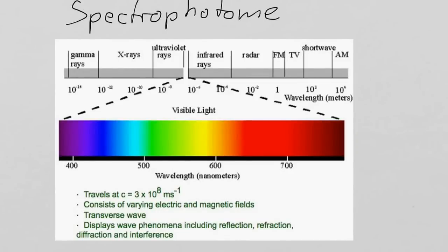So spectrophotometry is an extremely useful tool to measure concentrations, as you've probably experienced in the practical. And it is really based on how electromagnetic waves interact with matter. And once you've understood that and got the concept, then you can see what we can do with that.